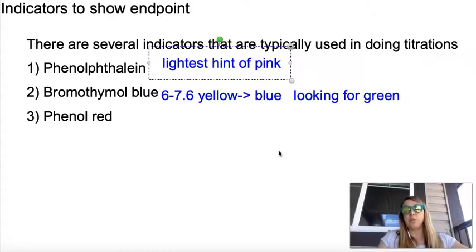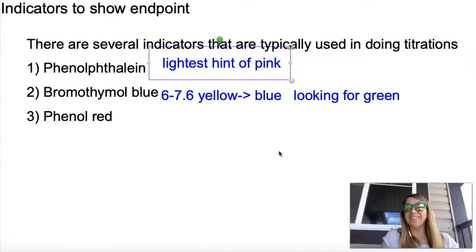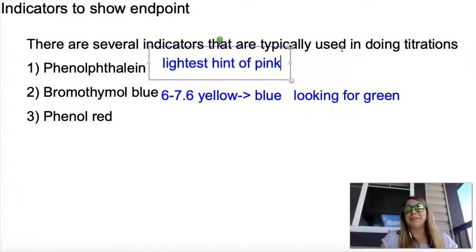So generally what we do is that first trial, there's someone's car alarm, gives us an idea of what volume we need to have. And then when we do our second trial, all right, took a little pause break to let the car alarm stop. Well, I don't remember what I was saying now.